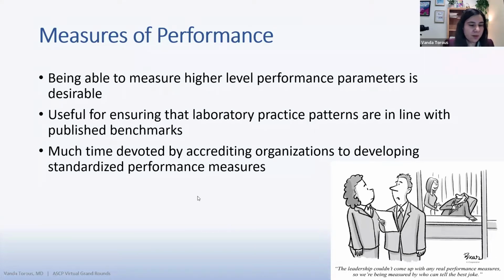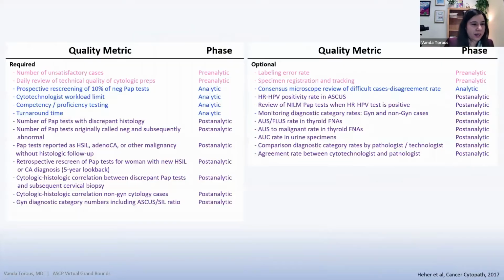What I'm talking about now is being able to assess performance, so a day-by-day sort of performance. Initially we talked about some quality controls. Those apply to laboratories in general, but can also apply to individuals, and same thing with these measures of performance. So they can apply to both individuals as well as the laboratory in general.